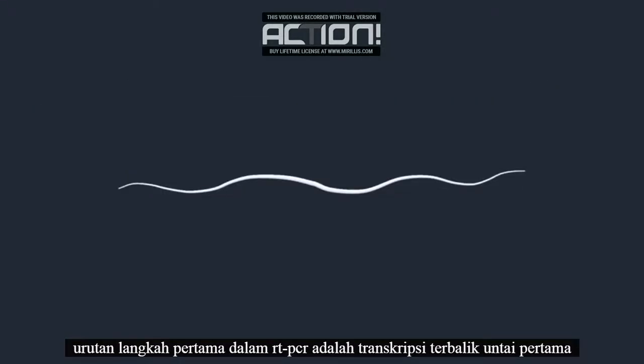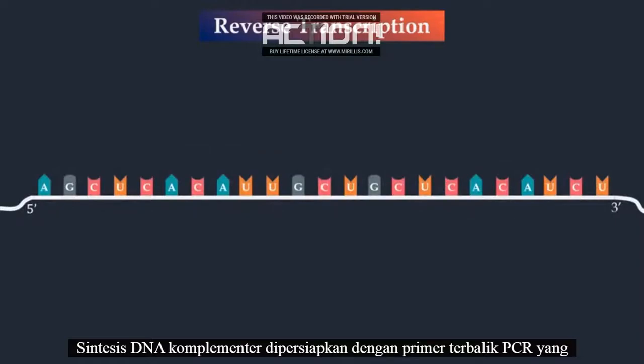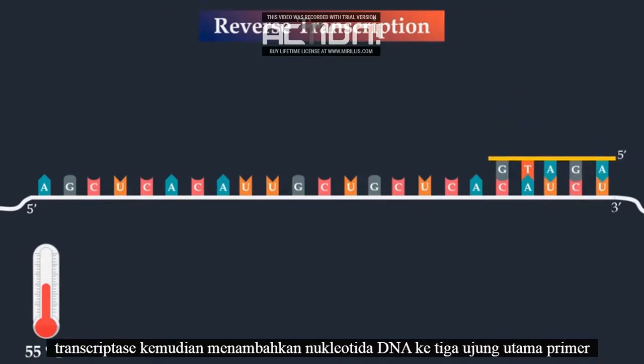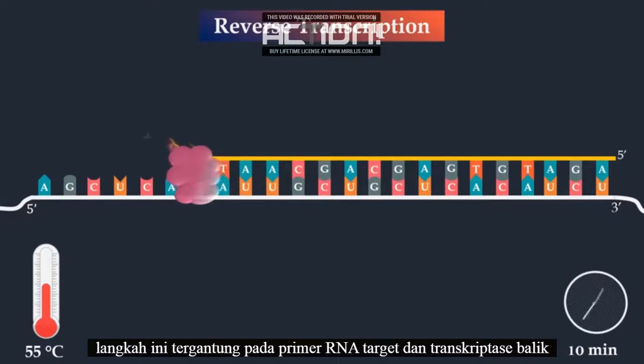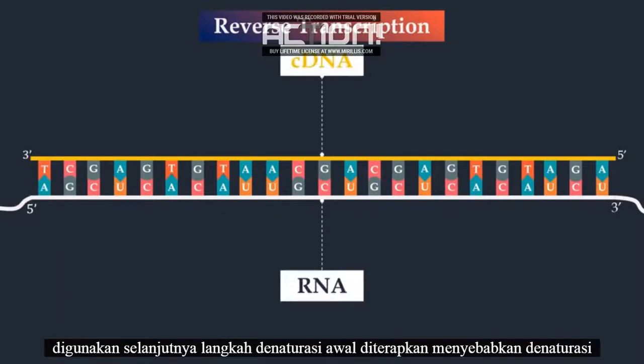The first step in RT-PCR is reverse transcription. The first strand complementary DNA synthesis is primed with the PCR reverse primer, which hybridizes to a complementary part of the virus RNA genome. Reverse transcriptase then adds DNA nucleotides onto the 3' end of the primer, synthesizing DNA complementary to the viral RNA. The temperature and duration of this step depend on the primer, the target RNA and the reverse transcriptase used.